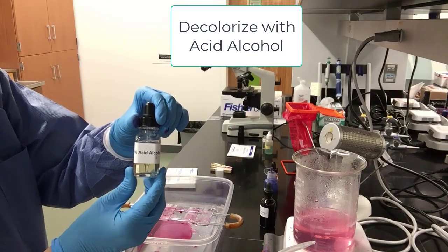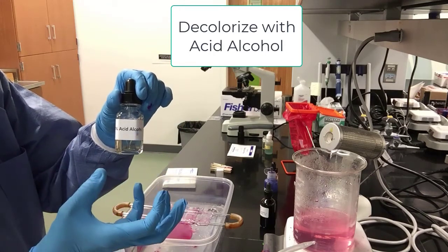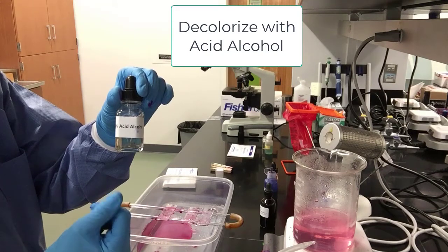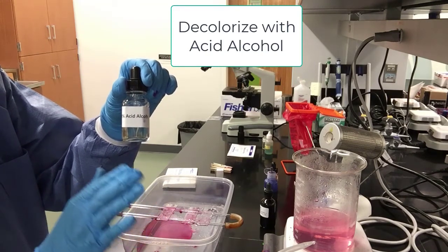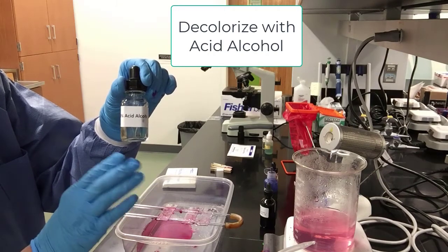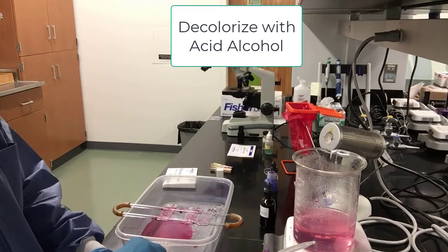So here's the acid alcohol. We will be decolorizing all our slides, but again, the acid-fast will not decolorize. The non-acid-fast will fully decolorize. We are ready to add the acid alcohol.